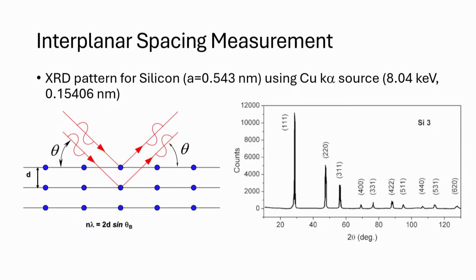It's a very simple procedure using X-ray diffraction, right? So you run a theta 2 theta scan, you get the various peaks from your spectrum. You come back to Bragg's equation, lambda equals 2d sine theta. The only thing that needs to be done is if you know what the sample is, you know what all the peaks should be, then it's easy enough to go in and index all the peaks, right? So this is a silicon, so it's FCC-like, so these peaks have to be all odd or all even. So you show them in the analysis that's shown here.